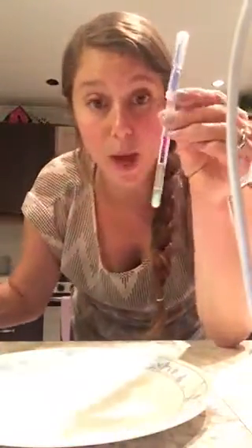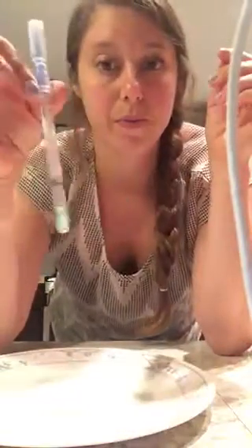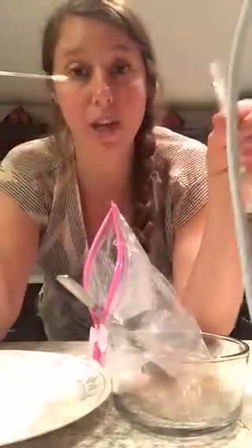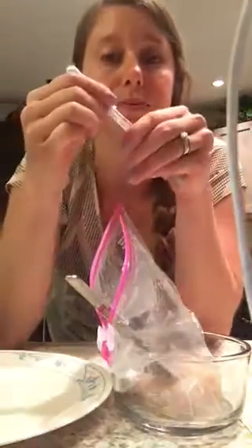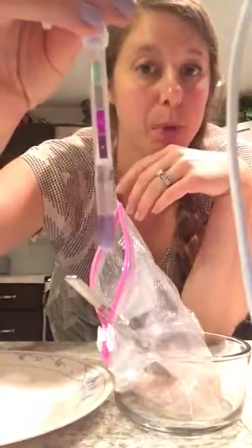So I'm gonna take my green swab and I'm gonna check for cleanliness. If it turns gray or purple, it means it detected protein, but if it stays green, it means that the surface is clean. Okay? Stick it in, shake it, and then this is the part you always wanna do. So you always wanna say, okay, this is for the skeptics out there. My swab is going to touch protein and you can see what's gonna happen. So I always just take my swab and just touch it back onto the protein. And sometimes you can see it right away, on the swab. Stick it in, give it a little bit of a shake, okay? And you can see purple is protein.